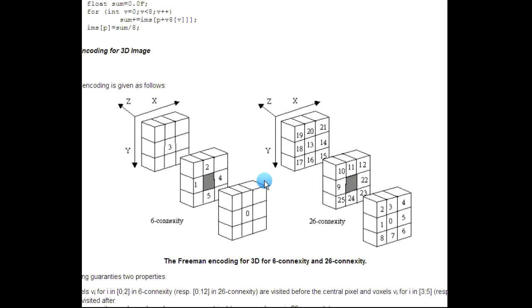Basically count all the voxels that are surface voxels, and the way I decide a surface voxel is based on the connectivity, whether it is 6 or 18 or 26 connectivity. If a given voxel is deemed a surface voxel, then count it towards the surface area calculation. And the user can also save the voxels that have been used to calculate the surface area as a volume.